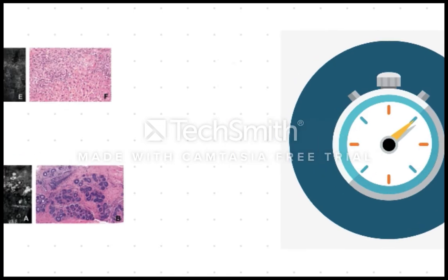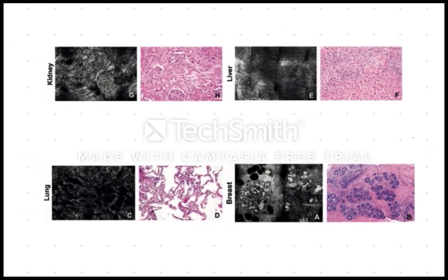They acquired the tissues within 5 to 10 minutes and were able to examine and give primary diagnostics within 5 minutes as well. They noticed that the CFM images bear a similar resemblance to the H&E specimen tissues, but the only downside they observed was the small focal areas, and the CFM showed a lack of sharpness, but it was noted that it only occurred in a few specimens.